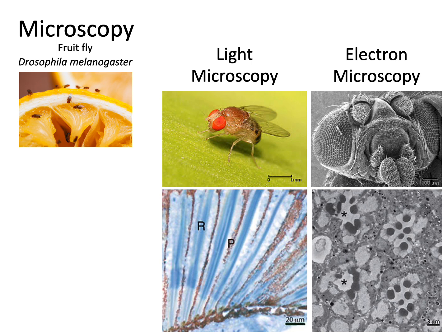On the lower left, this is also light microscopy, and this is part of the eye of the fruit fly. So they have compound eyes, ommatidia. Their visual systems bear some similarities to ours in terms of visual pigments or proteins that are specific to certain wavelengths and so forth. But the structure of their eye is really different. On the lower left, this material was stained to give rise to some variation in pigments to visual eyes.